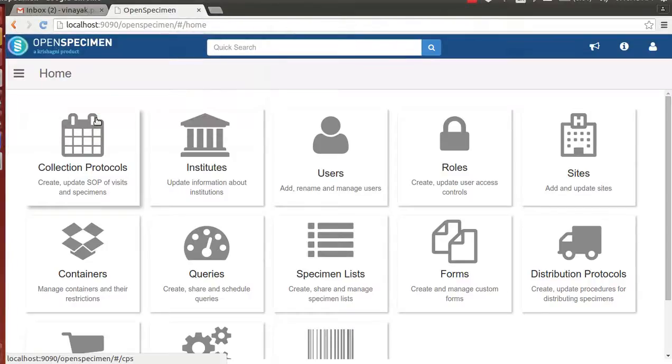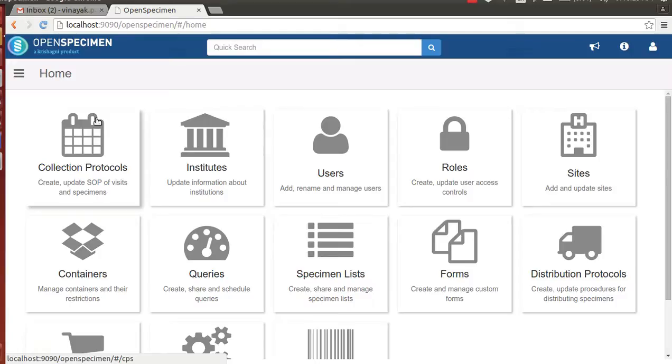Hi there. Welcome to OpenSpecimen feature demonstration of custom plugins. In this video demonstration, I would like to walk through custom specimen collection workflow developed by OpenSpecimen team for Stanford Medicine.